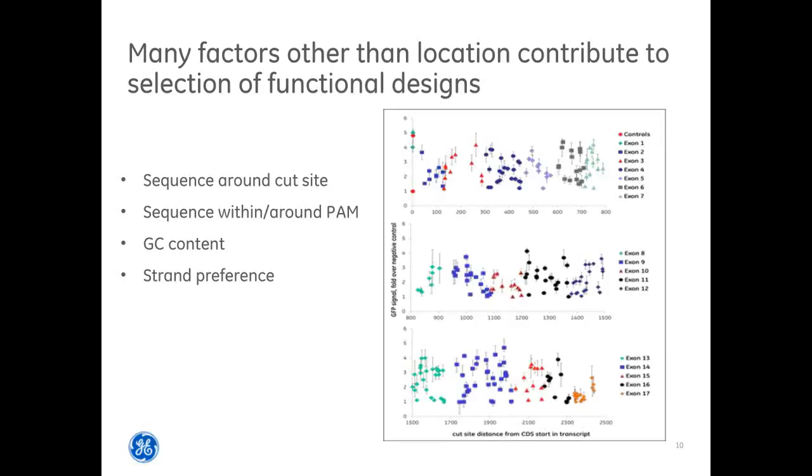Now, without doing a deep dive into the editor algorithm, I do just want to show you a quick couple pieces of data that illustrate the rationale behind it and why algorithm-designed CRISPR RNA is important. So using a functional knockout system, generating data from over 1,100 CRISPR RNAs across 10 genes, one of those genes is shown here, we identified a set of rules to select the most functional designs, not just the potential creation of indels.